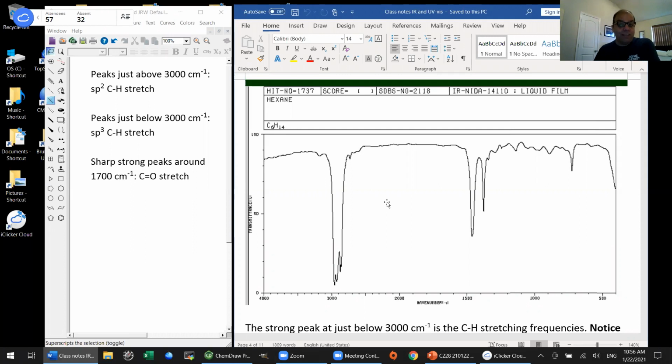But certainly, like I said, looking at this, the main information we get is what's not there. There's no carbonyl, there's no alcohol, no carboxylic acid. I don't see an aromatic ring. I don't even see any carbon-carbon double bonds. There's pretty much nothing. There isn't much of a difference between the IR of hexane and cyclohexane. Well, they might be a little different, but I don't think you'd find significant differences.